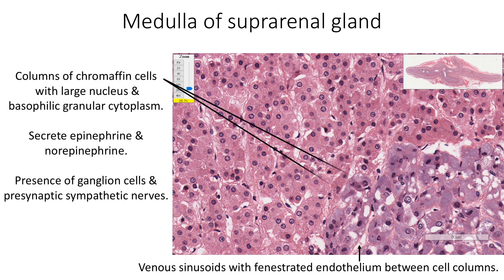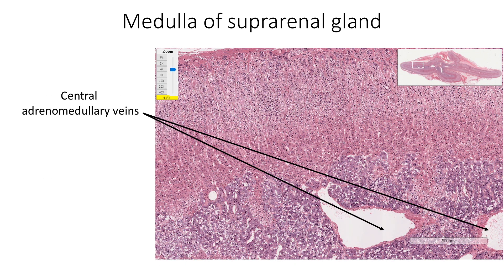The medulla of the suprarenal gland shows chromaffin cells arranged as columns. These chromaffin cells are the postganglionic sympathetic neurons with no axons. They are large cells with a large nucleus and basophilic granular cytoplasm. Most chromaffin cells secrete epinephrine; a few secrete norepinephrine. In addition to chromaffin cells, we also find a few ganglion cells as well as preganglionic sympathetic nerves. Between the cell columns, we find venous sinusoids with fenestrated endothelia. The medulla also shows sections of central adenomedullary veins.